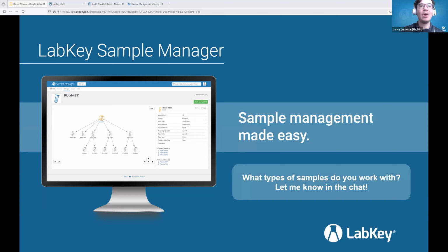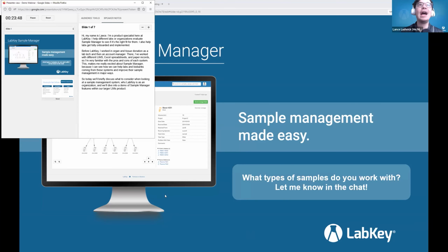My name is Lance. I'm a product specialist here at LabKey. I help labs or organizations evaluate Sample Manager to see if it's the right fit for them. I also help labs get fully onboarded and implemented. Before LabKey, I worked in organ and tissue donation as a lab tech and then an account manager. There, I've worked with a bunch of different LIMS, both homegrown and off the shelf, Excel spreadsheets, and paper records. So I'm really familiar with the pros and cons of each system.